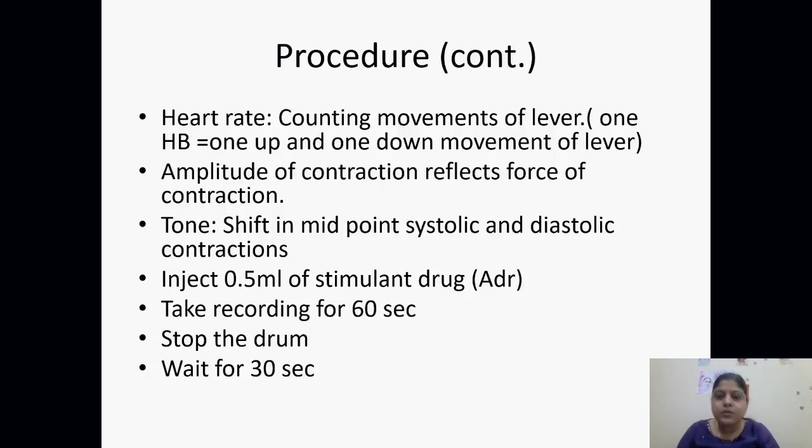First of all, what is heart rate? Heart rate is counting the movements of the lever, one heartbeat, one up and one down movement of the lever. Heart rate is one upward and one downward movement. That is one contraction. That will be one heartbeat. Heart rate is how many heartbeats per minute.